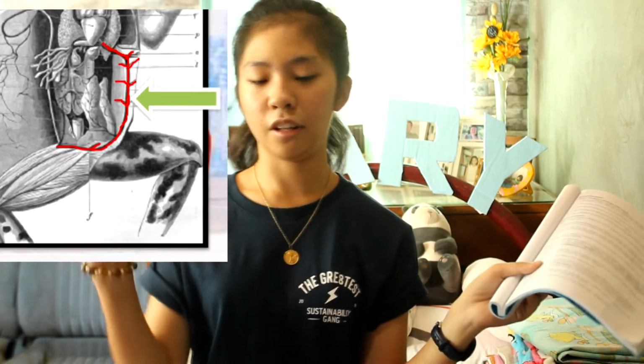Next is to spread the body wall to the side by cutting across the body wall posterior to the forelimbs and anterior to the hind limbs, and posteriorly cut the rectus abdominis muscles longitudinally near the midpoint. Do not cut along the ventral line. This is the linea alba, and below it is the abdominal vein. Cutting this area will allow the blood to spread over the specimen. The linea alba is the line in the middle of the frog. And the ventral abdominal vein is a blood vessel attached to the abdominal wall. I marked that red.